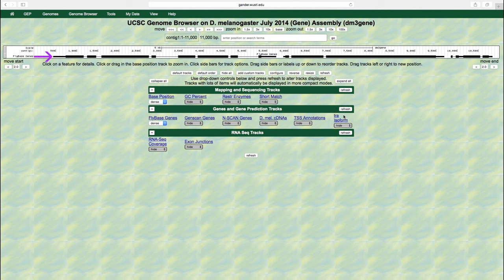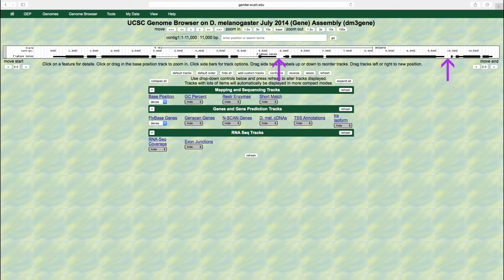To determine how many genes are in contig1, we will count the number of features in the fly-based genes track. Each feature consists of one or more boxes, which correspond to exons. The lines that connect two adjacent boxes correspond to introns. A gene is composed of a collection of boxes, or exons, and lines that connect them together, or introns. The gap between two adjacent genes is known as the intergenic region.